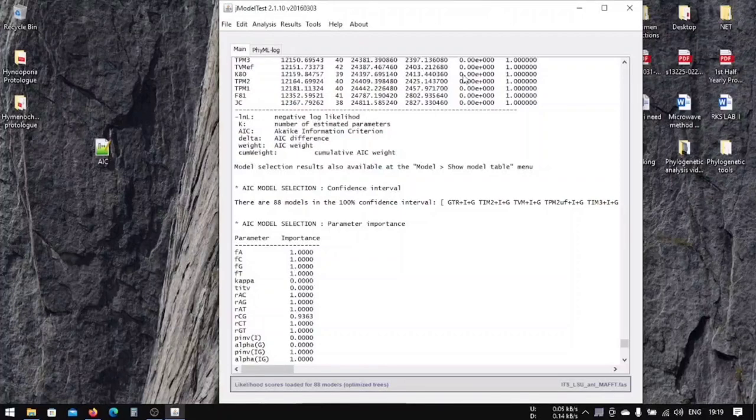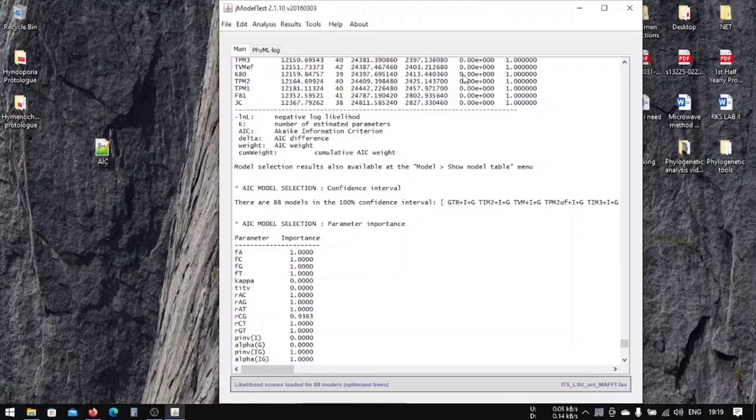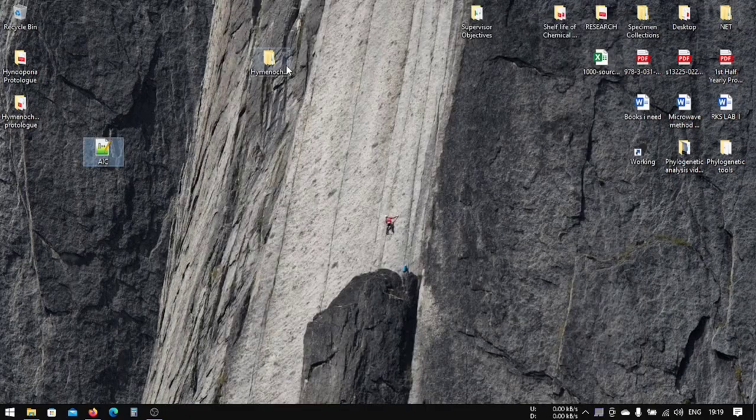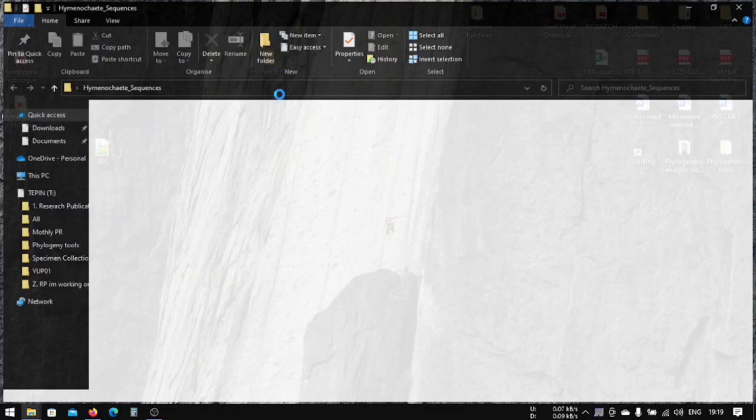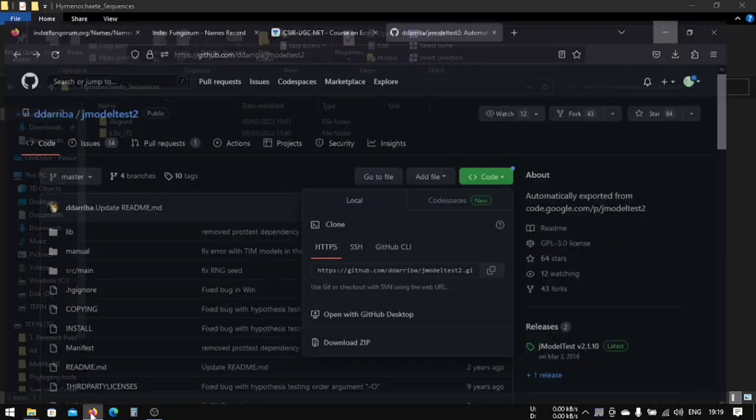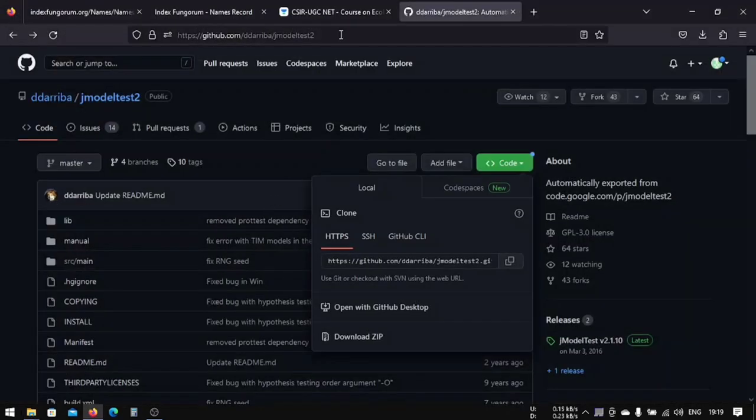Our next lesson will be the maximum likelihood analysis using RAxML, and it's going to be a little longer, so I divided this into three parts. Let's start with our first one. After we're done with the general test, the next thing we're going to do is maximum likelihood analysis using RAxML.